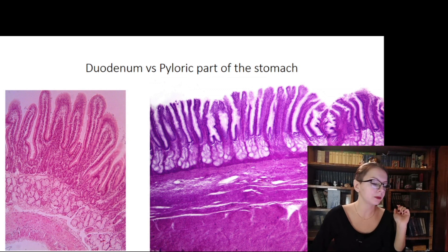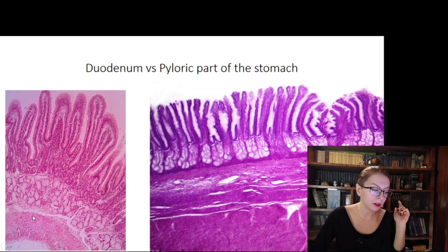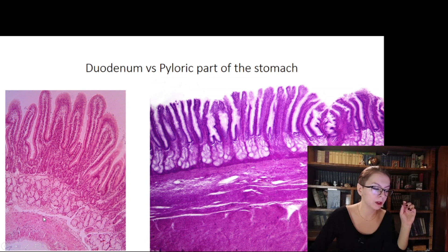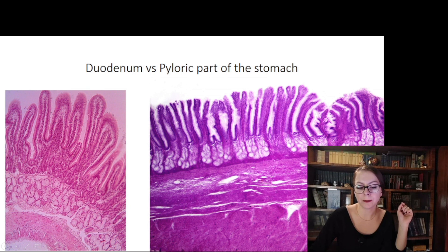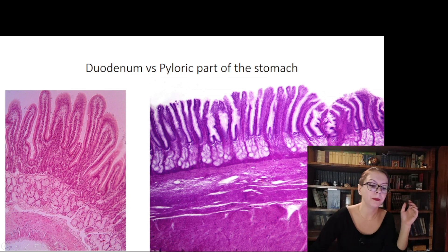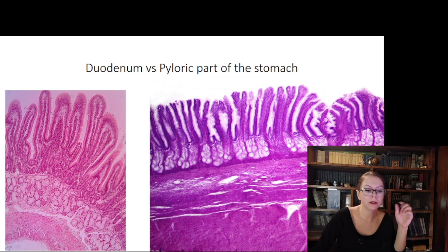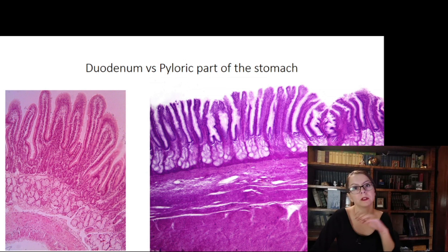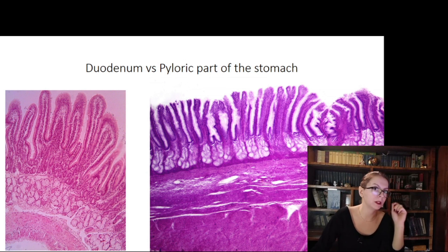The first criterion is the thickness of the muscularis. In the duodenum you may see two layers, and the total thickness of the muscularis is much less than the thickness of all other layers. If we look at the pyloric part, the muscularis is very thick because it is very close to the sphincter region, and the thickness of the mucosa is much less than the thickness of all other layers. So the relative thickness of the muscularis is the first criterion.